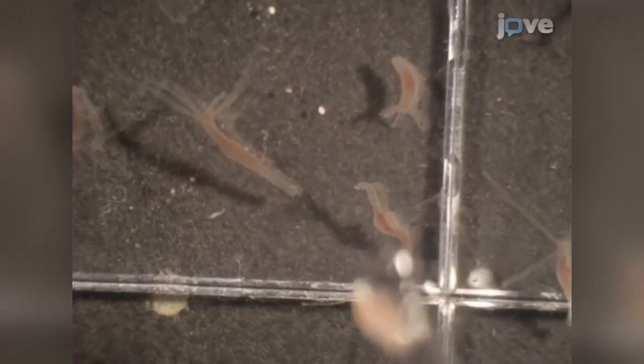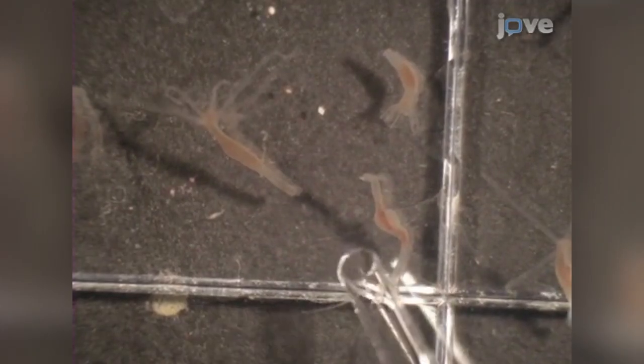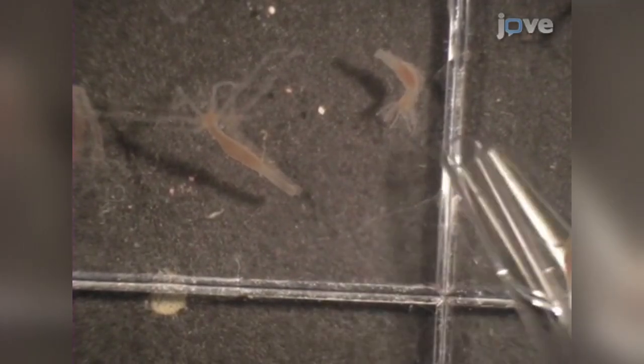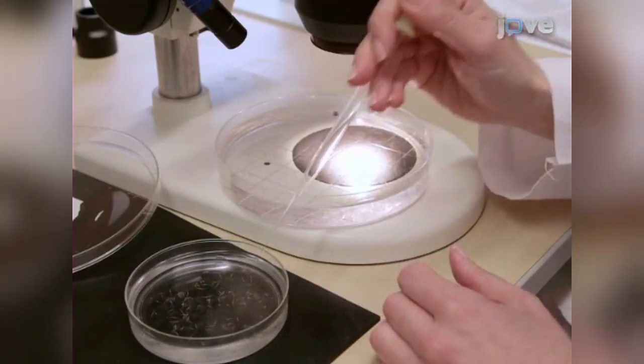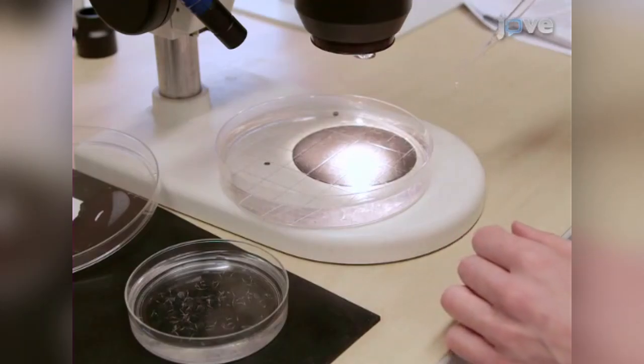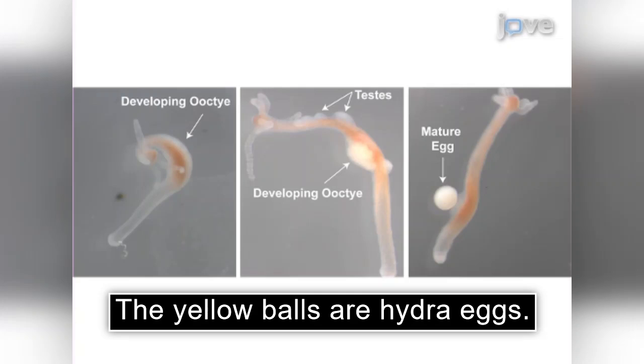To prepare embryos for injection, begin by scanning a Hydra AEP strain culture for polyps producing eggs. Collect these polyps and transfer them into a separate culture dish. Observe these polyps every few hours during the day to monitor the progress of egg formation. When eggs break through the ectoderm and sit on a ring of retracted ectodermal cells, they are ready for injection.